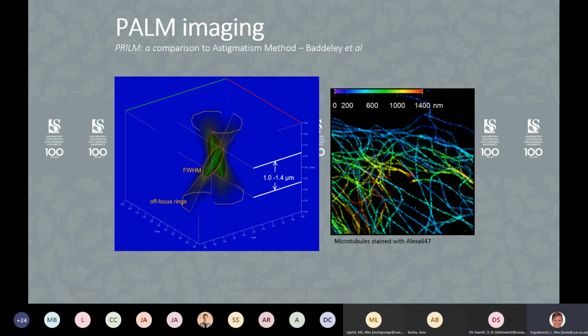The important part is not to have a lot of noise. You've heard a lot about signal to noise ratio in the previous talks, and noise makes it very, very hard to get to these fantastic images. So you always have to try and get rid of noise, and in your case, the thickness of the sample above and below what you want to see would make it very, very difficult to get rid of the noise. Does that answer your question? Yes, it does. Thanks, Lisa. Right, cool.